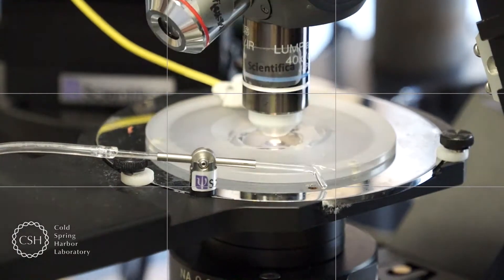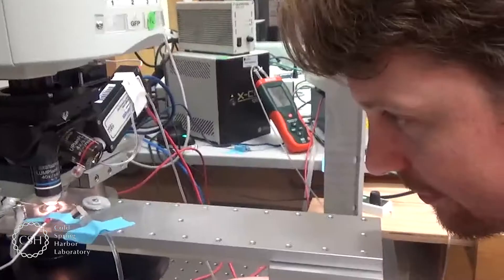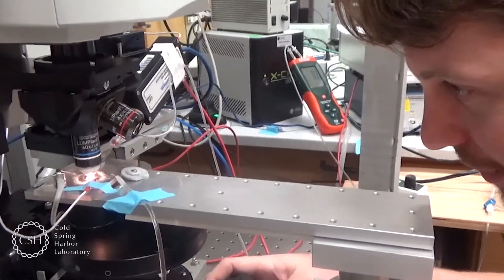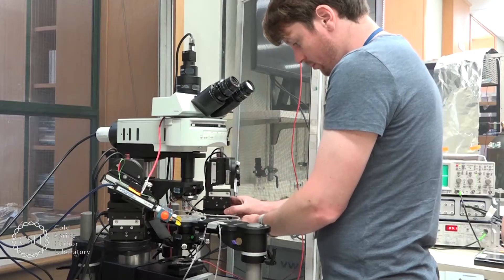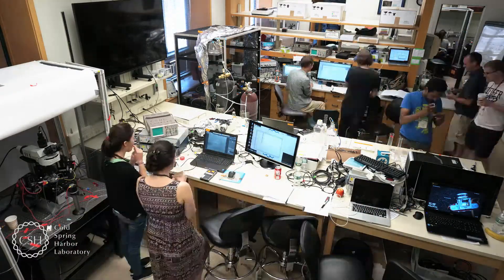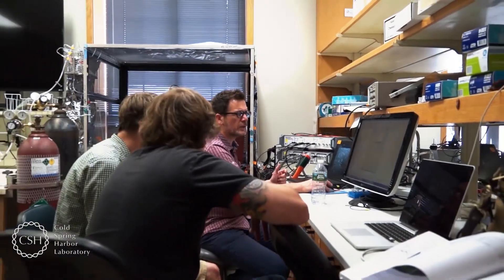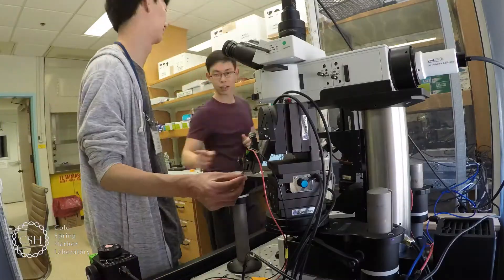Scientifica have supported the Cold Spring Harbor Ion Channels course for a number of years now. The Ion Channels course is three weeks of intense learning to discover as much as they can about ion channel physiology and to get their hands on in the laboratory and really learn how to carry out these techniques. It's a very intense three-week course — every day runs from 9am to about 2am, where the students have access to unparalleled supervision and hands-on experience.